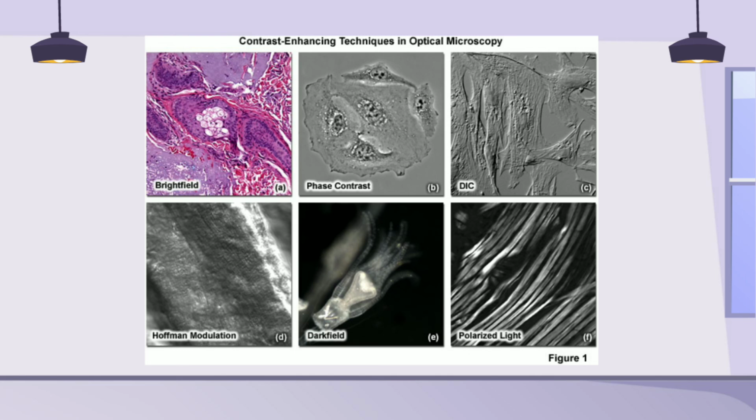Before we hop on to another lesson, let us discuss the importance of light microscope. Light microscopes play an important role in many research laboratories, including electron microscopy facilities. They can be used as a primary visualization tool or in support of electron microscopy. So generally, light microscopes are very important.